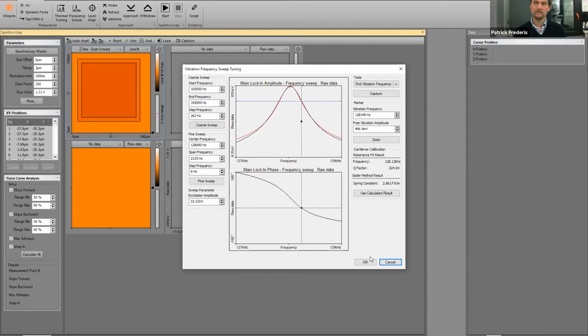In air, you can put a 0.01 Newton per meter cantilever in, but because of snap-in and water films, you will not get to the very low forces. In liquid, you can get to these very low forces, and the approach is the same as in air.